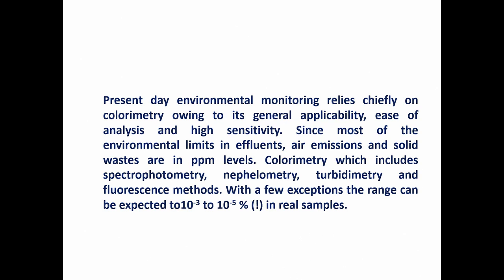The present day environmental monitoring relies chiefly on colorimetry, owing to its general applicability, ease of analysis and high sensitivity.